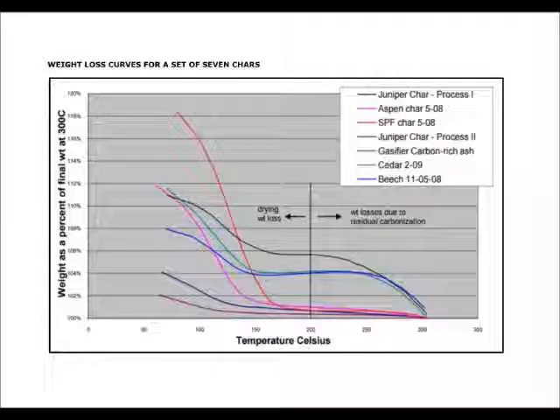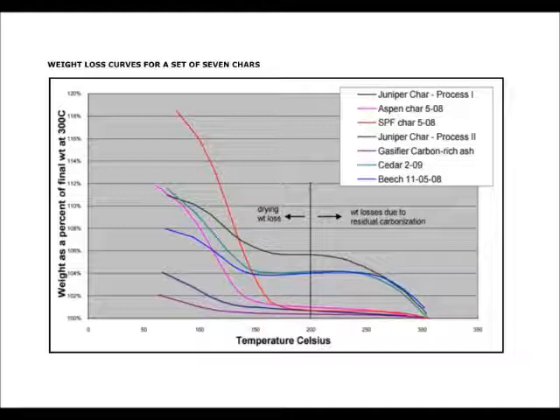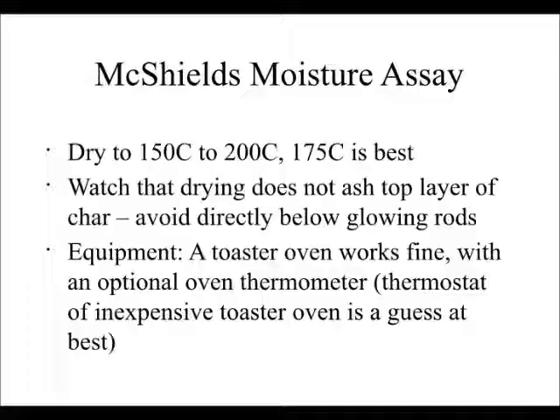Now, after 150 C, you'll notice some of these other curves drop off quite dramatically. This is because above 150 degrees C, and especially above 200, you're starting to get into areas that if the material has not seen these temperatures before, it'll start to then further pyrolyze. This is torrefaction-type materials. And if that's happening, that's another big flag. Because now you've got a char that's telling you right away, I've never even seen 300 degrees C. I'm black because the guy spray painted me black and stuck me in a bag and labeled it biochar. Is America a great place or what? So, just to summarize this, you want to dry it to 150 to 200 degrees C. I like 175.